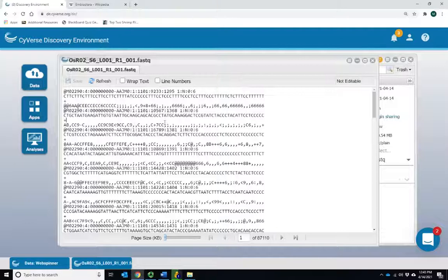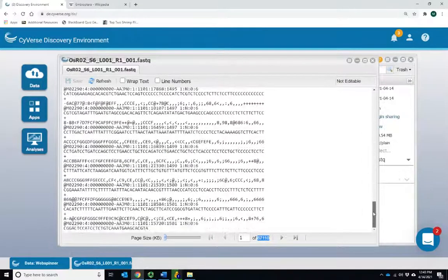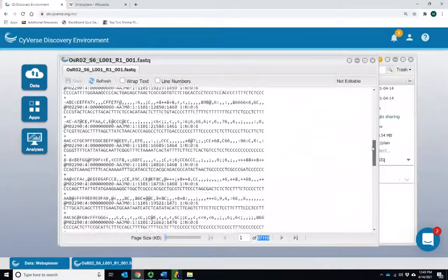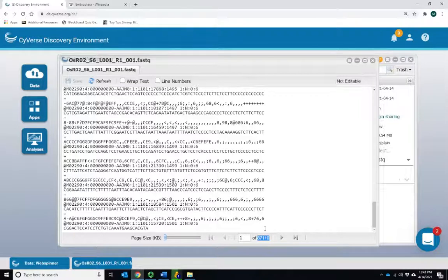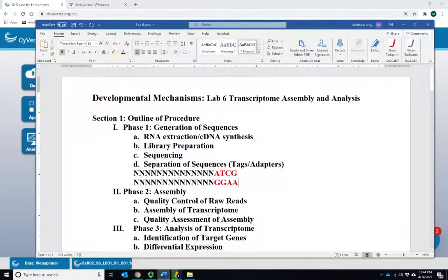We end up with this massive, massive file — 87,000 pages that we would need to look at, each containing maybe around 100 sequences. And that's just for this one sample. We would want to go through these sequences and do some quality control, and that is the first step. So that's what we're going to walk you through here for the next part. We'll look at some questions for section two, and for the assembly of our sequences, the first thing we do is a quality control of the raw reads.